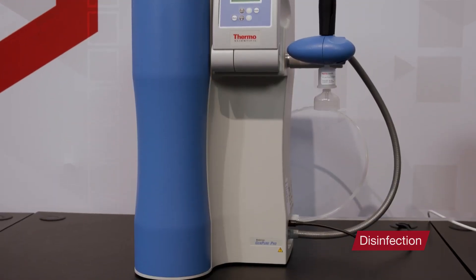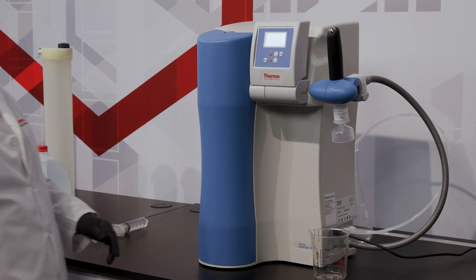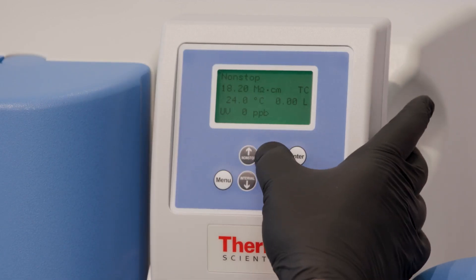To start the disinfection process, turn off the system's water supply, then turn off the system itself by pressing the blue on/off button.